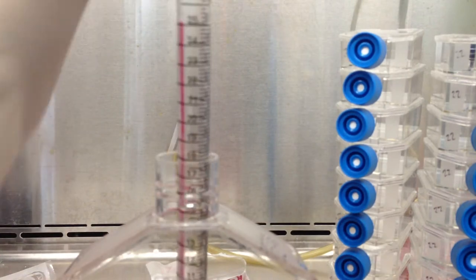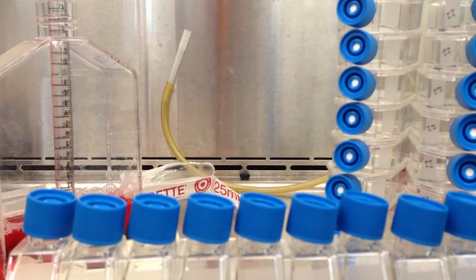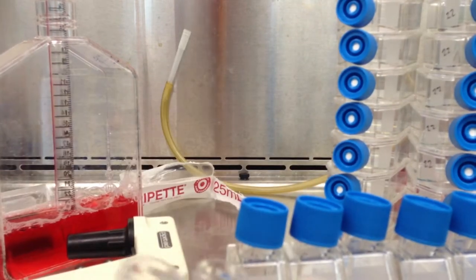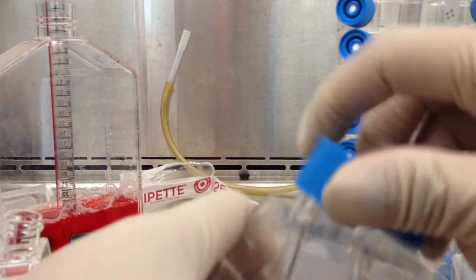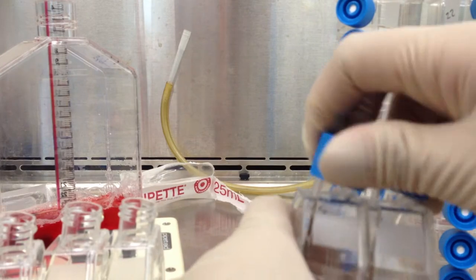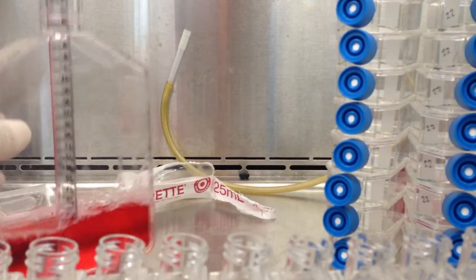Okay. Leave that for right now. And then we'll take a stack. And I'm going to take off all the caps in one stack. Make sure to put your caps down on the hood, because you should already have sprayed your hood. And if you spill anything, make sure to use ethanol and spray it down again. And take off all the caps on the flask. Put it in a line. Get my pipetter.